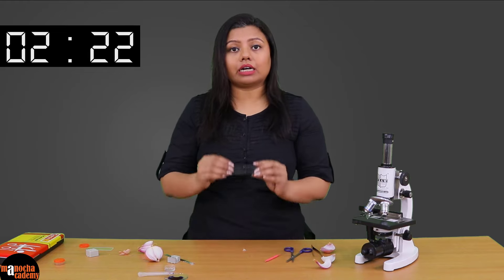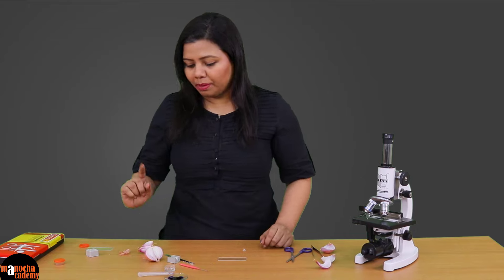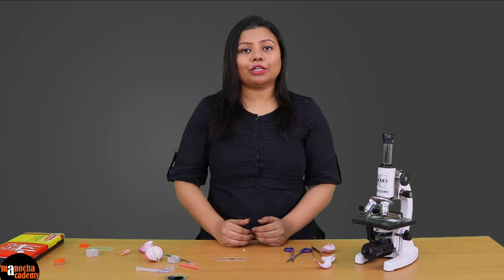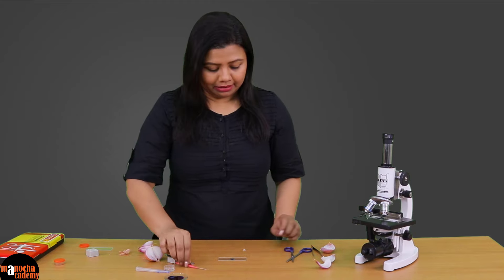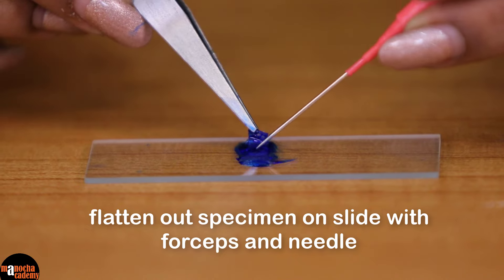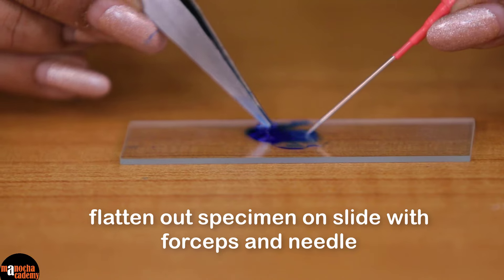After this we will take a clean glass slide and place the stained specimen on it. But before that we will use a little bit of glycerine and put it on the slide. We are using glycerine because we do not want the specimen to dry out while we are observing it under the microscope — the glycerine will keep the specimen moist. Now we will take the specimen out of the stain and place it on the slide. Make sure that the section does not roll; if it is rolling you can hold it with your forceps and tease it with the needle so that it is straight and laid out on the slide.